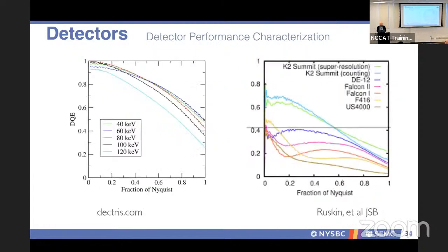That's highlighted here, where the DQE of the detector will improve the lower your accelerating voltage is. The reason for that is that if you're trying to analyze different electron hits, with lower fluxes and lower accelerating voltages, you potentially could have a better DQE. But there's a crossover in the sense that if you do get that shot noise, a higher accelerating voltage would be better. You can see different curves in journals, and you can compare different cameras.